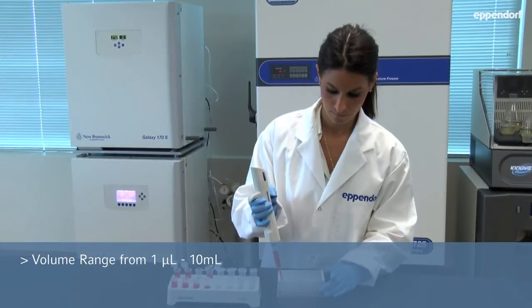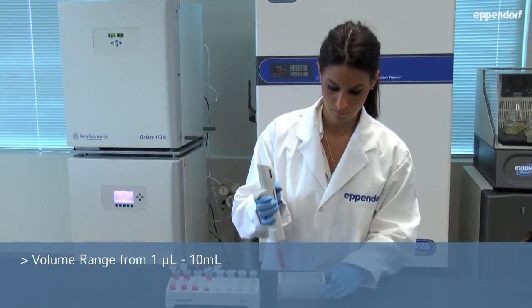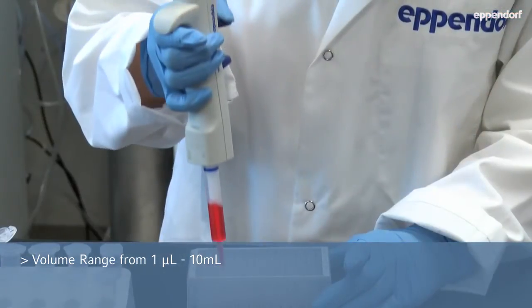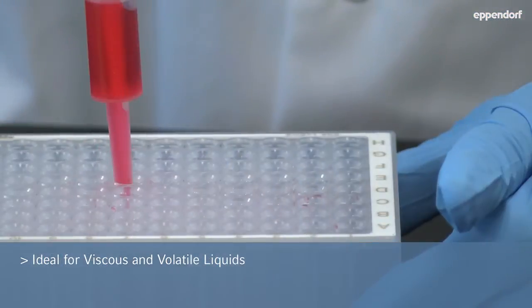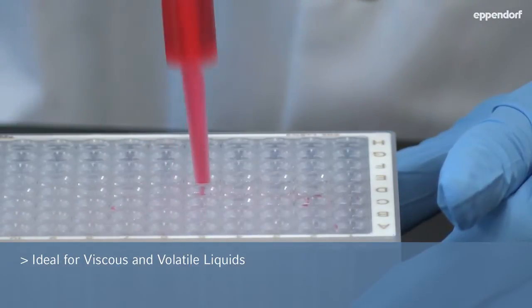Whether you're dispensing 1 microliter or 10 milliliters, the Multipet M4 delivers correct dispensing volumes you can count on, regardless of density, viscosity, or volatility of the liquid.